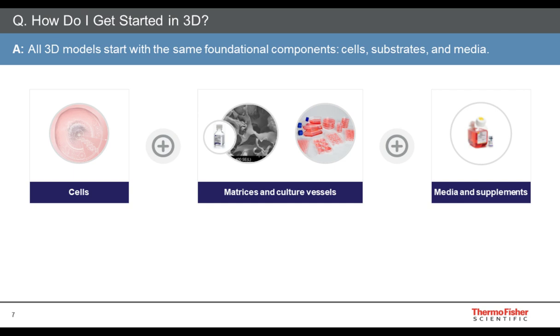An example of this is looking at the pluripotent status if you're working with iPSC cells. If you don't have a good QC assessment of just how good your iPSCs are, then every time you form a 3D model with these and differentiate them into different types of organoids, this is going to contribute to a lot of the variability that people see from sample to sample and experiment to experiment. So, being able to have QC tests that create a standardization, if you will, within a workflow is definitely something that people need to be aware of.